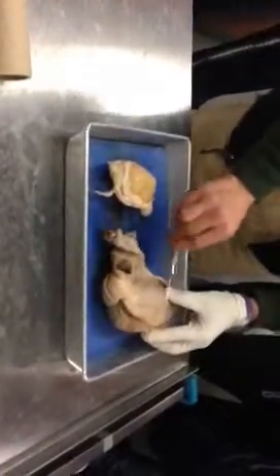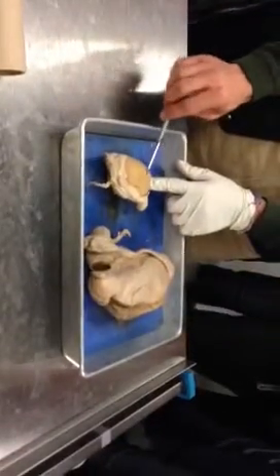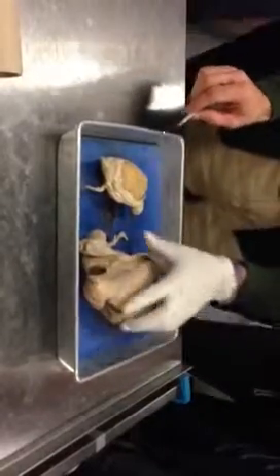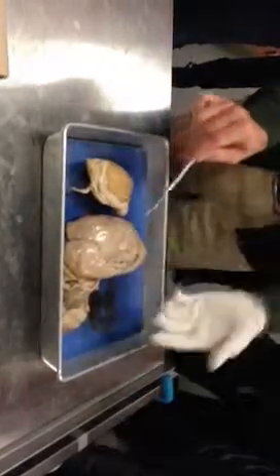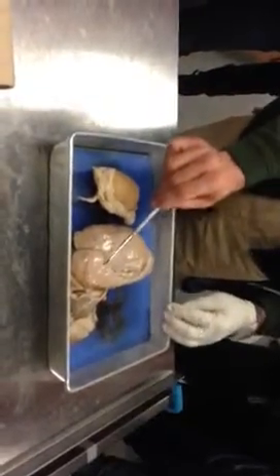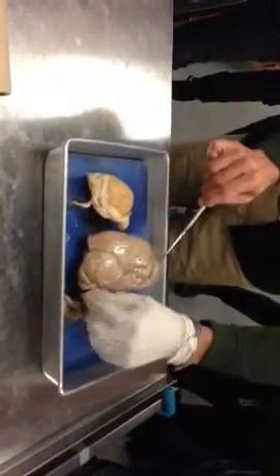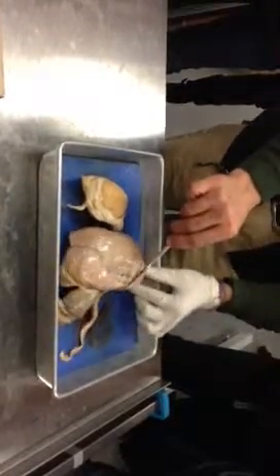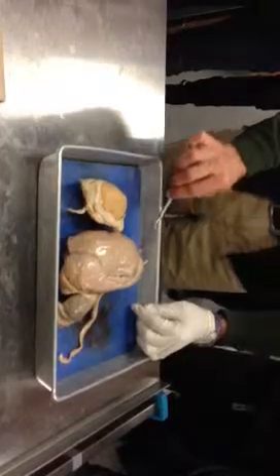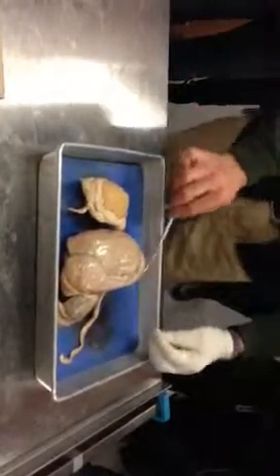So where should we start? First of all, this is the testicle here. It's kind of big. And the sheep testicle is here, in a kind of off-color orange. And then the epididymis is around it. So this is the epididymis on the bull testicle. This is the better view, that's why I flipped it over. Head of the epididymis is near the top. So this is the top. Body goes along the side here, the body of the epididymis, and then this is the tail of the epididymis down at the bottom. It's kind of thicker. It has a big lumpy bottom part.